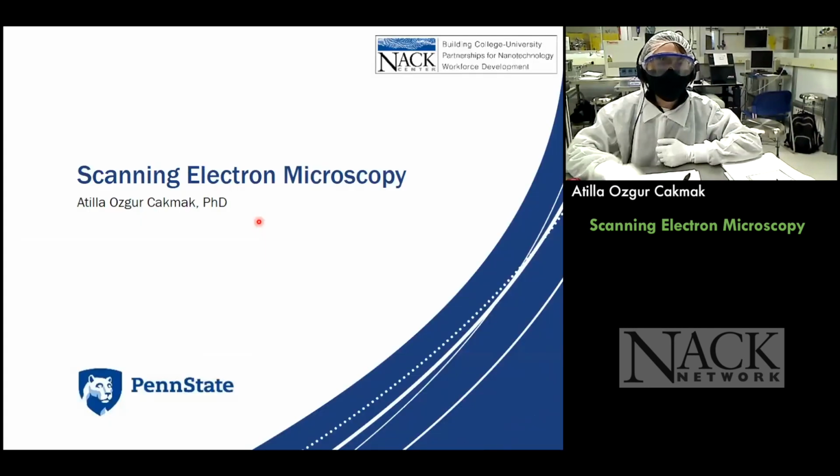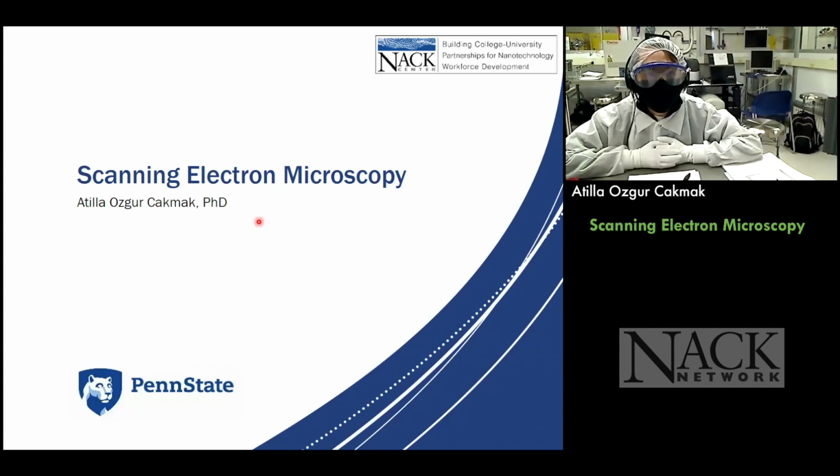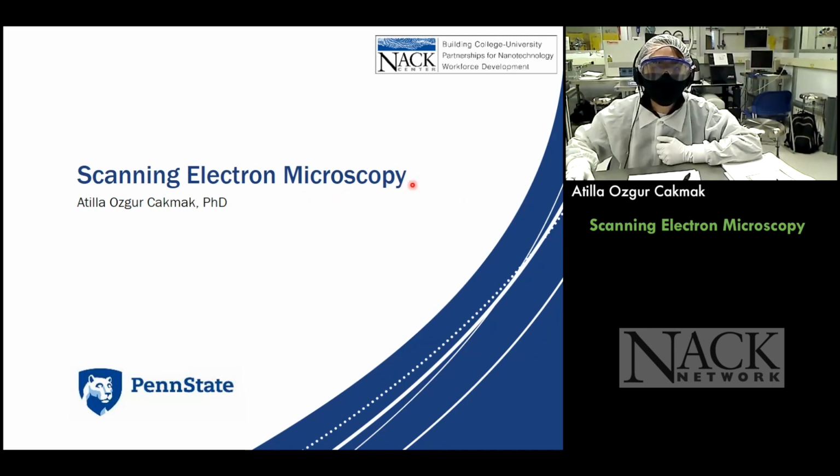All right, so we're going to be talking about scanning electron microscopy and other characterization methods, but we're going to work with electrons this time, and we're still going to scan the surface. Those names are abbreviations. SEM will be extremely important in understanding how the tool works.